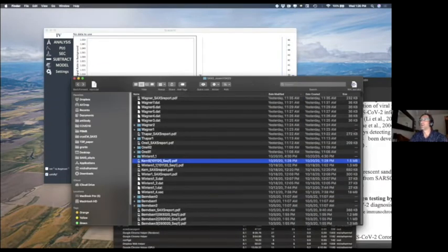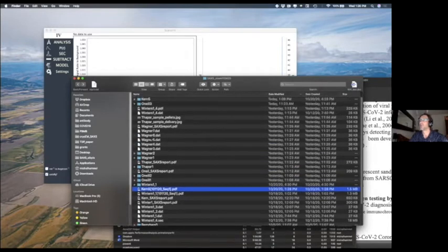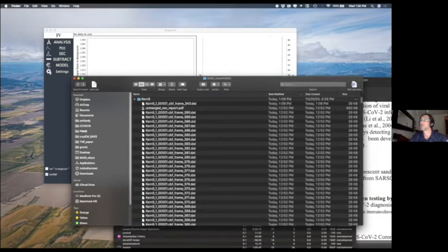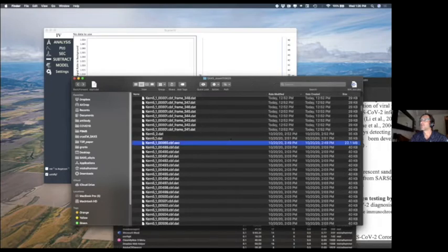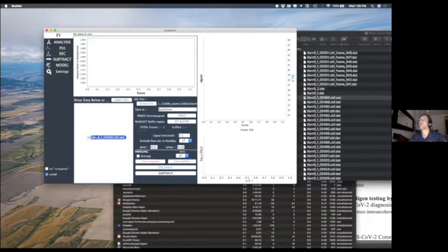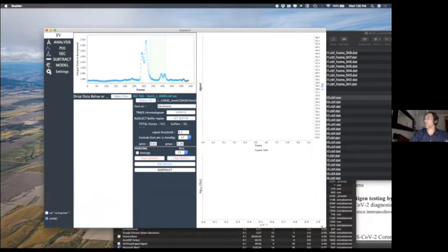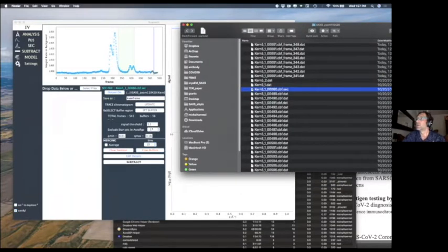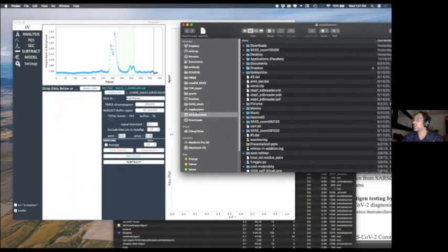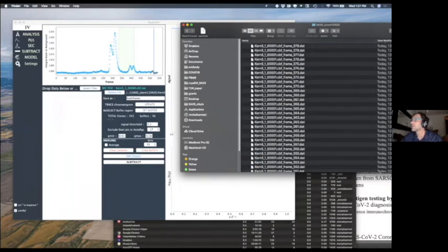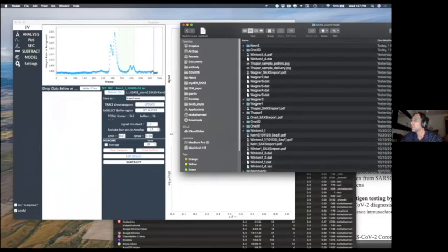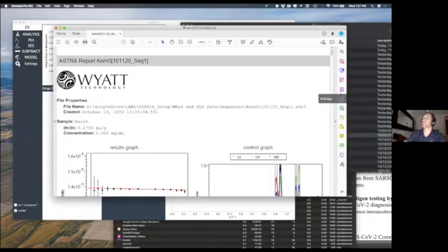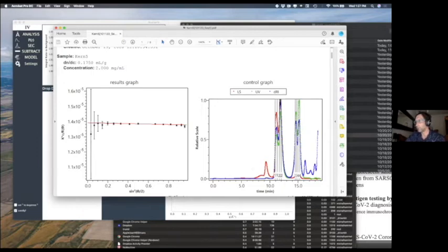Generally what you can do is take your SEC file and directly drag the file into SCATTER. What you see here is the size exclusion SAXS signal where every dot is one SAXS frame integrated intensity, and you can compare that with your MOLSTAT report. It's very similar — there's some aggregation you can see, and we have two peaks and two very small peaks for the peptide.